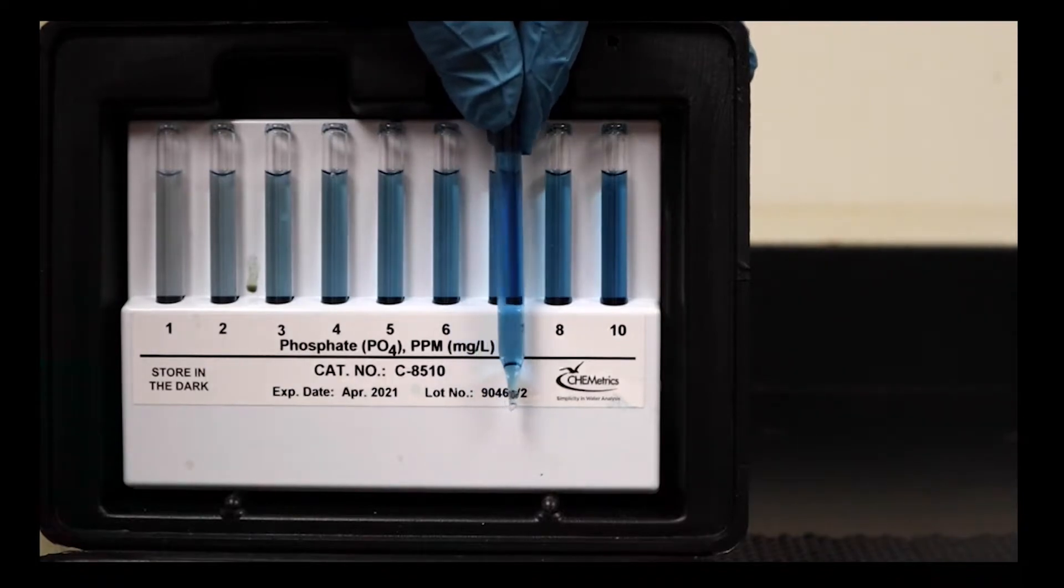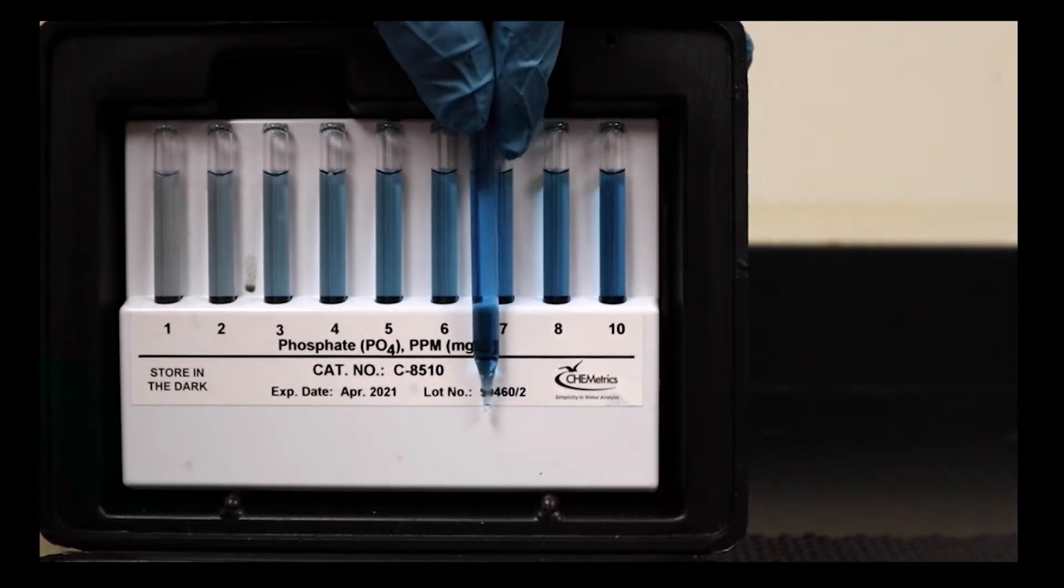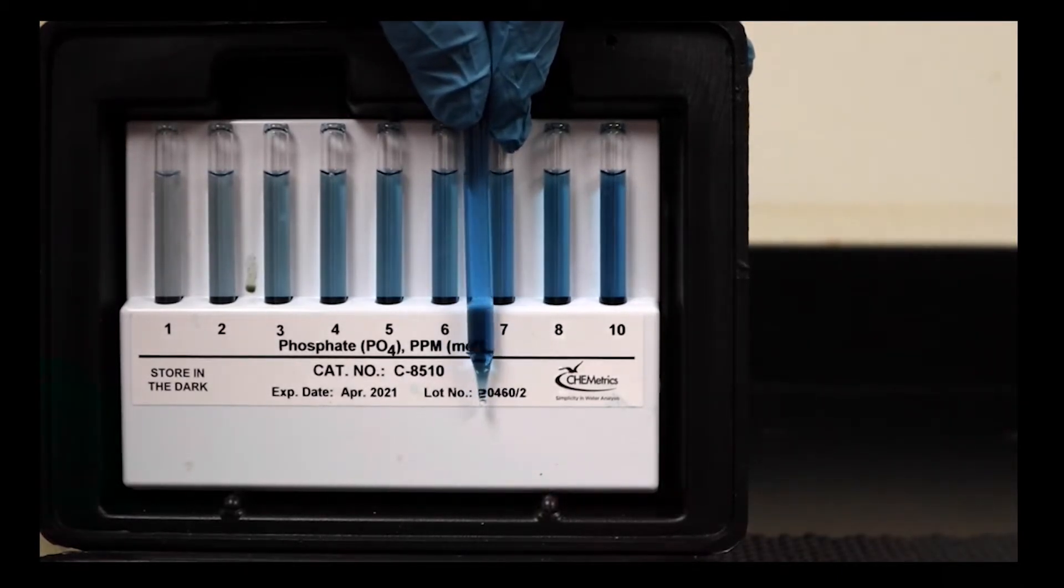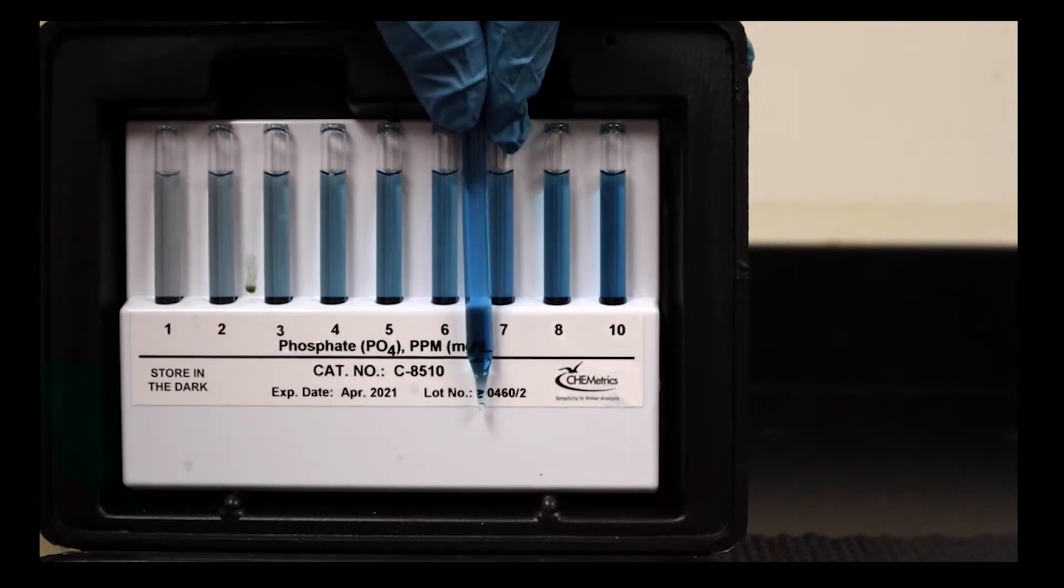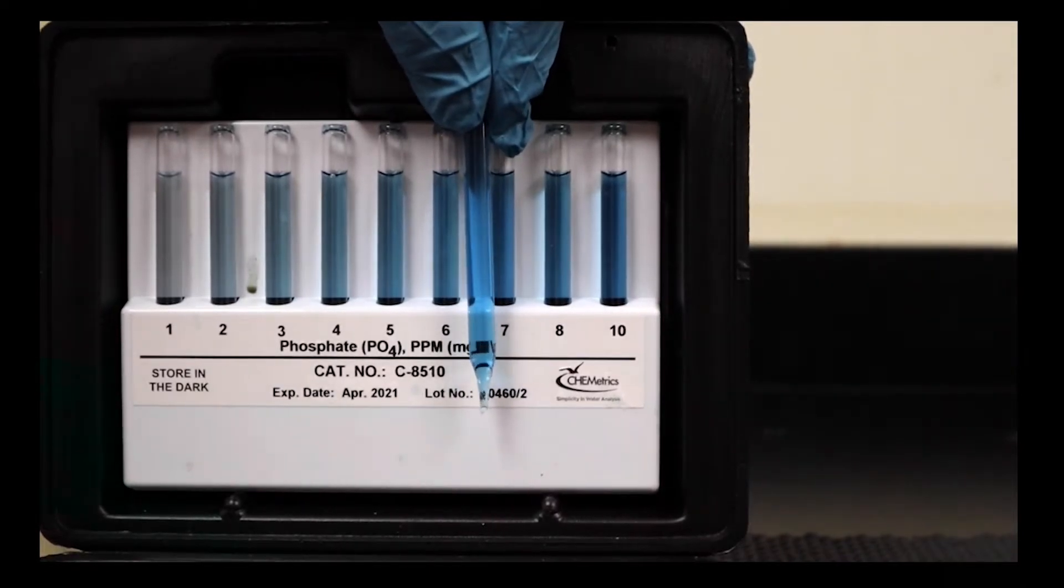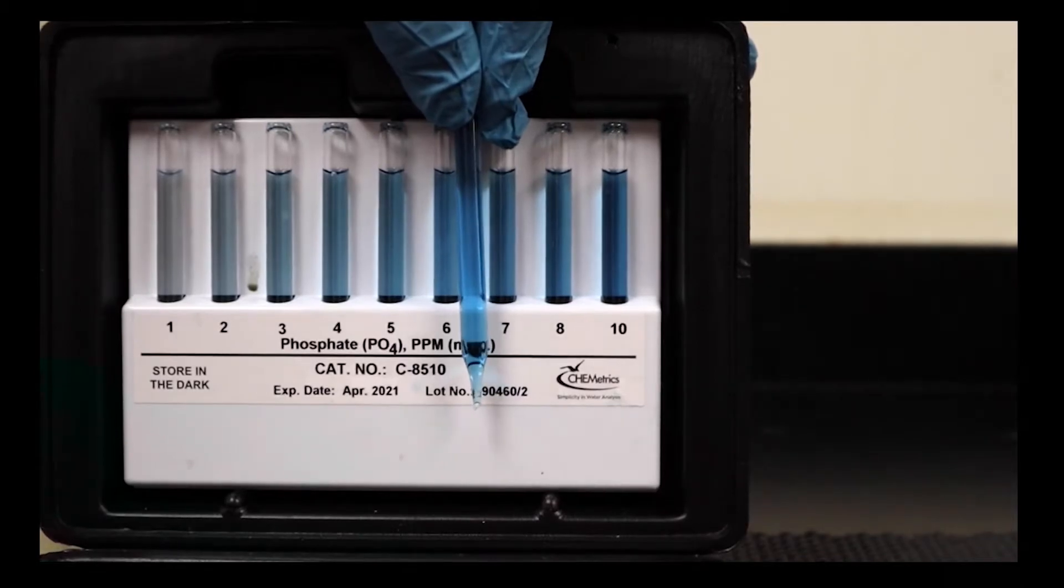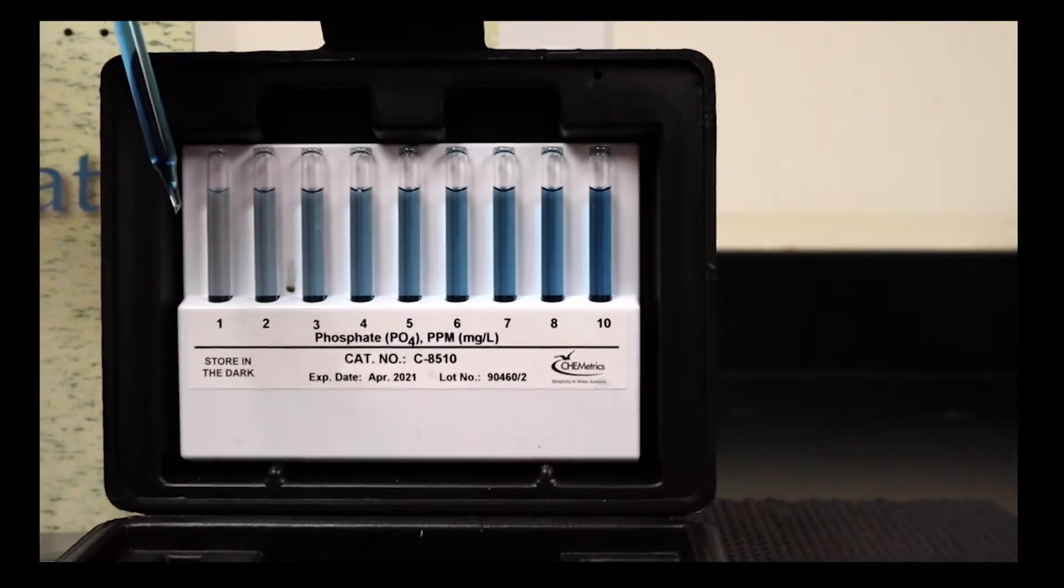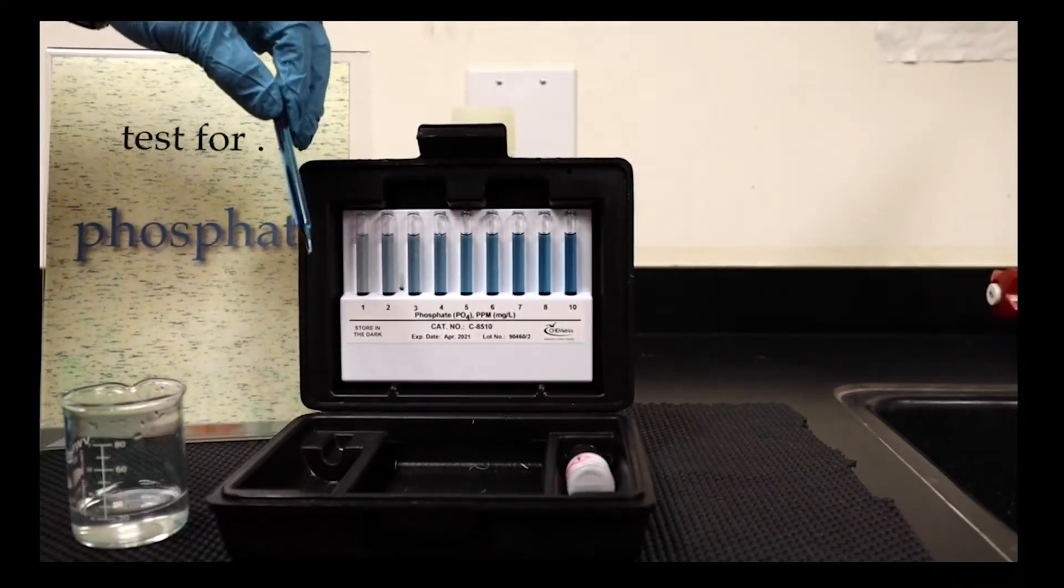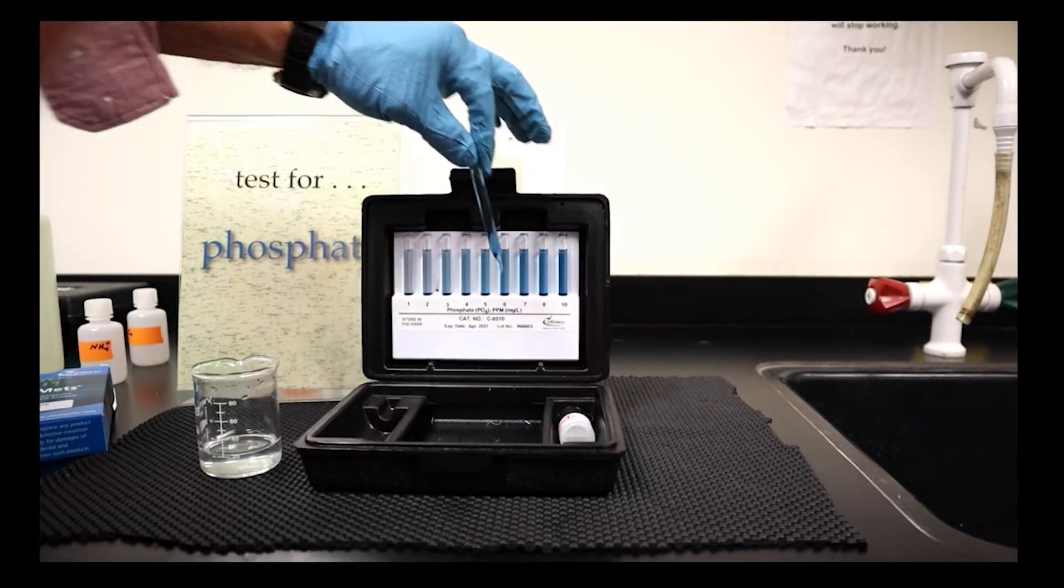It's not quite as dark as these guys. I'd put this at somewhere between six and seven, maybe closer to seven. That means this one's got about 6.5 parts per million.